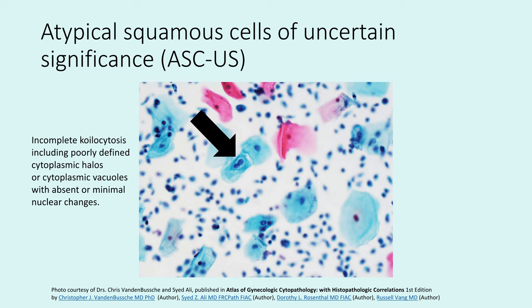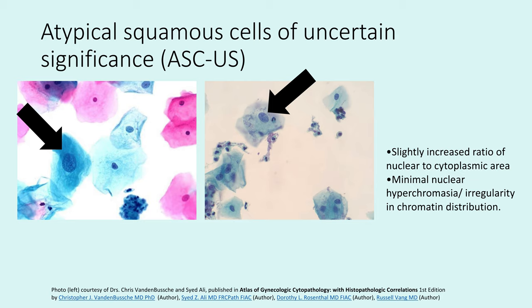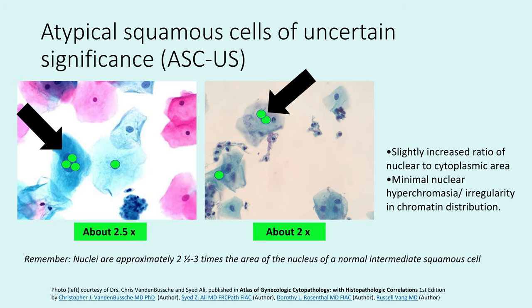This is an example of an ASCUS diagnosis noted at the arrow, where we see incomplete koilocytosis in a binucleated cell, but the cytoplasmic halo is poorly formed and there is not really good nuclear enlargement in that cell. Two other examples show a slightly increased ratio of nuclear to cytoplasmic area and minimal nuclear hyperchromasia, but no real irregularity in the nuclear outline or chromatin distribution. To gauge nuclear size, about two to two and a half intermediate cell nuclei fit into the nucleus on the right-hand side, and about two and a half to three on the left — always compare to the intermediate cell as your ruler.